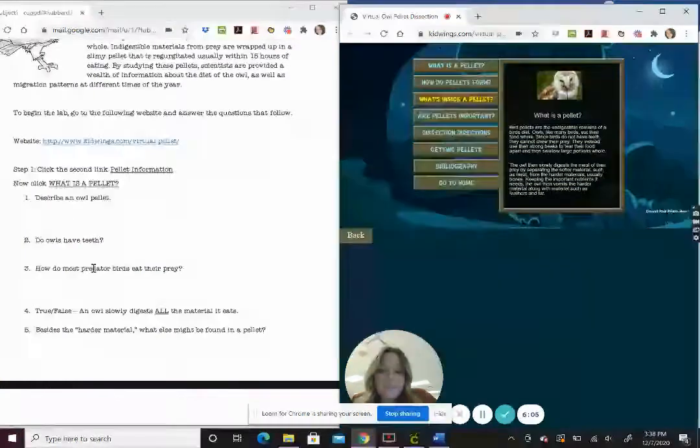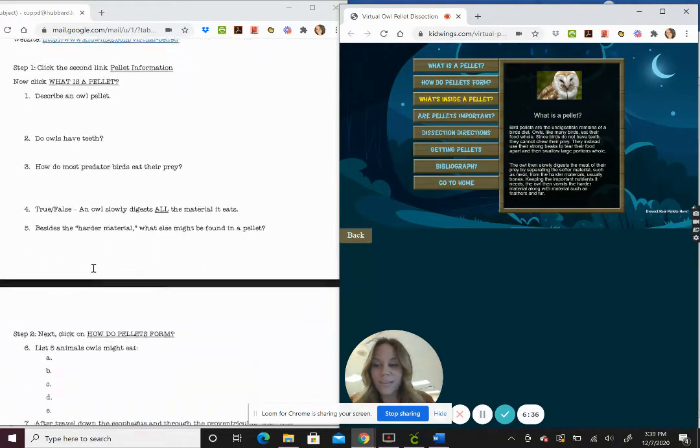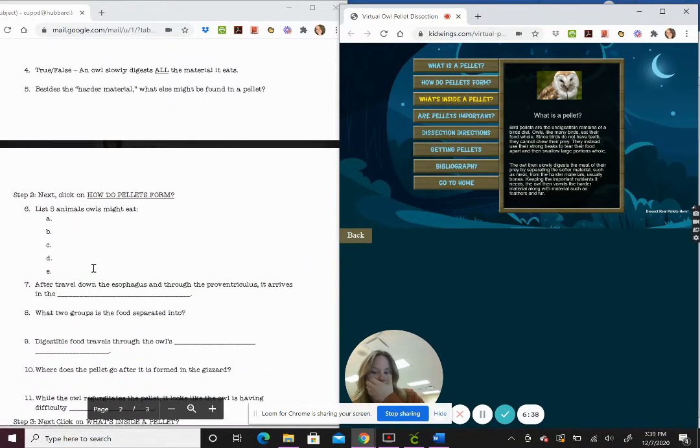Do owls have teeth? How do most predator birds eat their prey? True or false? An owl slowly digests all material. Besides the harder material, what else might be found in a pellet? Actually, pause the video, answer those questions. After you answer those questions, unpause the video, and we'll move on to step 2.